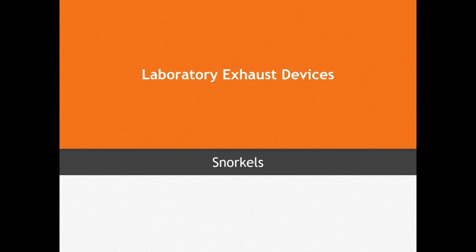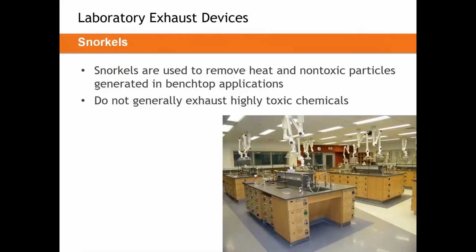So now we've covered fume hoods, which are likely the most popular. We've covered biological safety cabinets for laboratories and talked a bit about them in compounding pharmacies. We'd like to spend a bit of time here now on snorkels. There's not a lot to say about snorkels. They're a product we apply fairly regularly. I actually often present that snorkels are what can make a lab unique, because if you have one snorkel or 15, you get a very, very different lab, even if all other things are held equal.